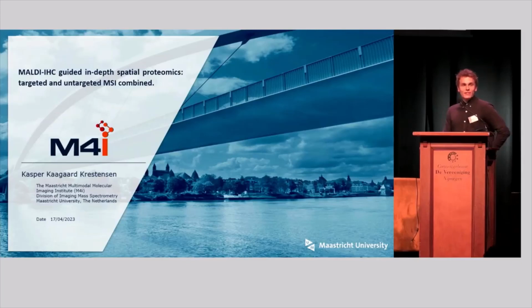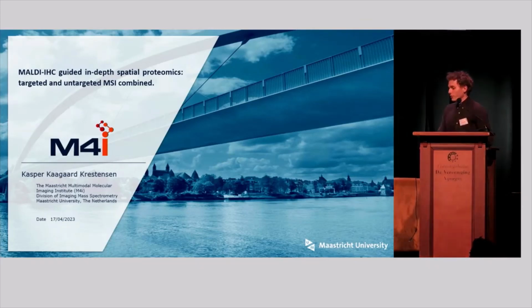So yeah, I just want to thank the organizers first for this great meeting. So I'm going to be presenting a recent project that we did at M4I in collaboration with Ambergen and Bruker, which we've titled MALDI-IHC-Guided in-depth spatial proteomics, targeted and untargeted MSI combined. So that's a bit of a mouthful, so I'm going to take you through it now, step by step.